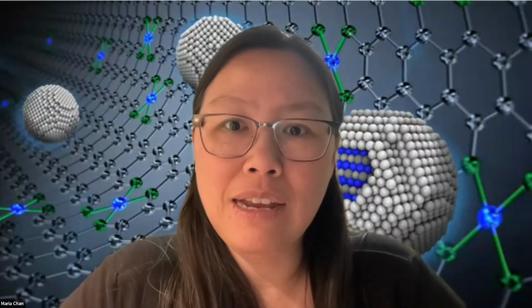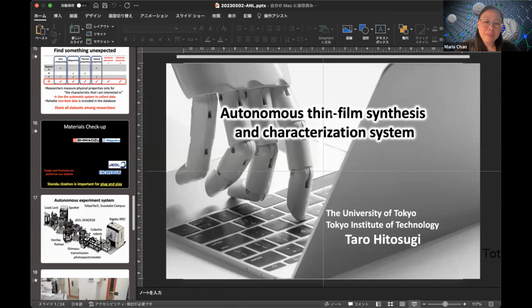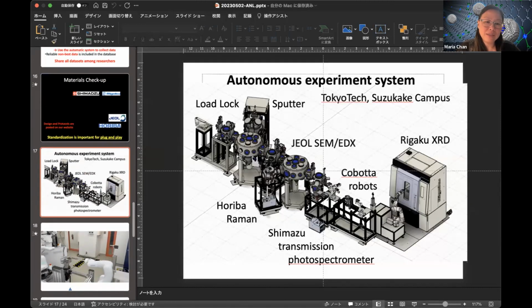One question I have about that setup though is that if I wanted to add another synthesis chamber or another experimental characterization technique, like I want to measure one more thing, it doesn't seem like that allows the scalability, versus the previous talk, the one that Yan showed, where they used the linear track. Maybe I didn't get that correct.